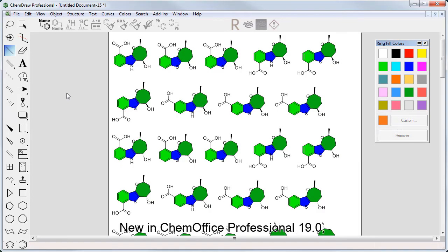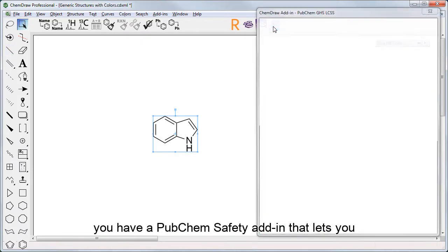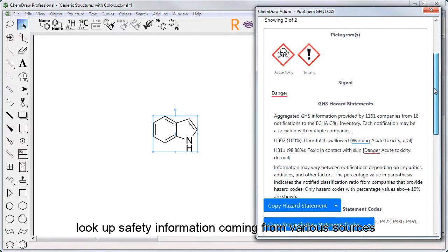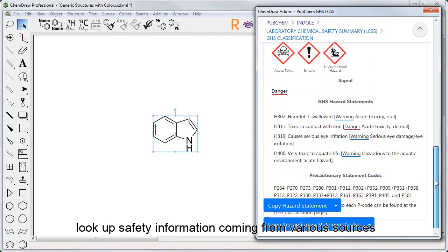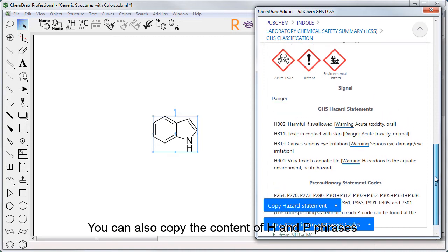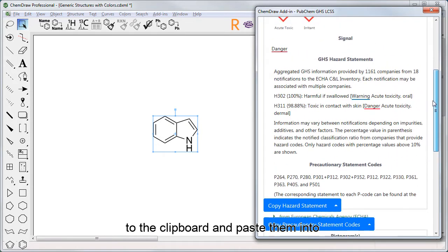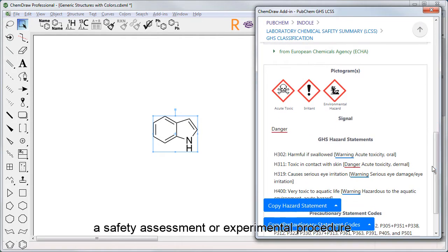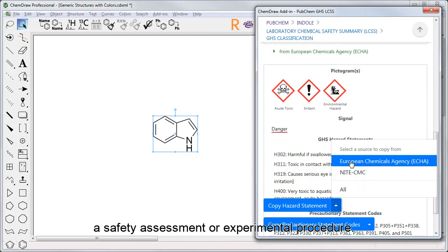New in ChemOffice Professional 19, you have a PubChem Safety Add-In that lets you look up safety information coming from various sources. You can also copy the content of H&P phrases directly to the clipboard and paste them into a safety assessment or an experimental procedures.